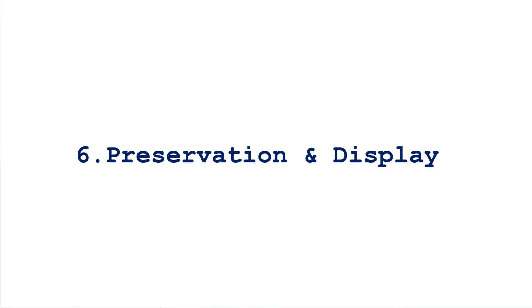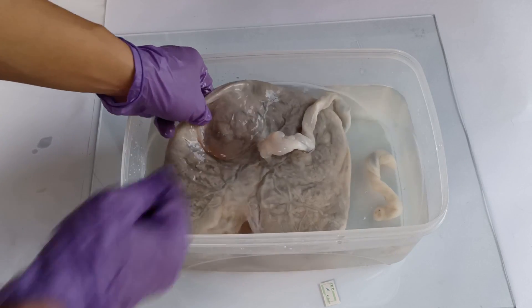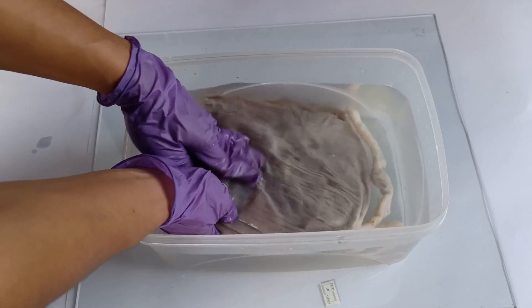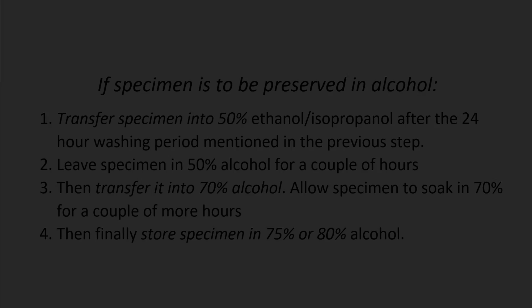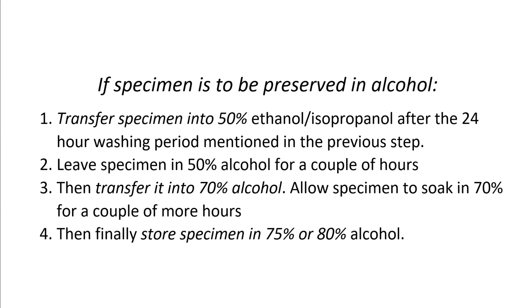After a week or so of fixation followed by a brief rinsing step, it's time to house the fixed placenta in its final display container and store it in an appropriate preservative fluid — in the case of a formalin wet specimen, this will be the same 8% formalin concentration used to fix the placenta. If using an alcohol as preservative, first transfer the specimen into 50% ethanol or isopropanol after the 24-hour washing period. Leave it in 50% ethanol for a couple of hours, then transfer to 70% ethanol for a couple more hours, and finally store the specimen in 75% or 80% ethanol.